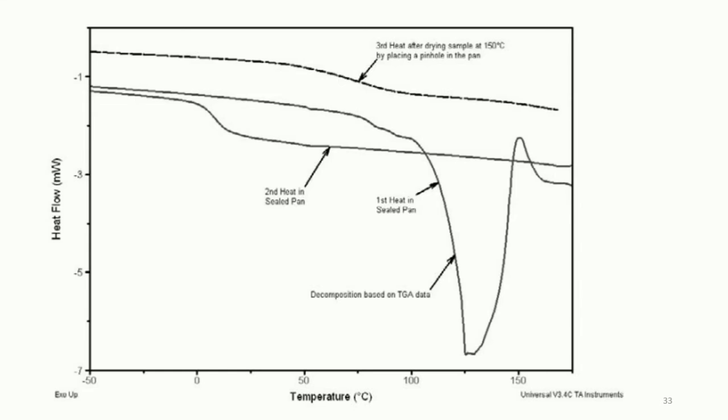When evaluating storage stability of this formulation, the researcher should look for the formation of a glass transition over time. One question that still needs to be answered is the actual temperature of the glass transition. This is quite an important question to think about and learn about for the compound.